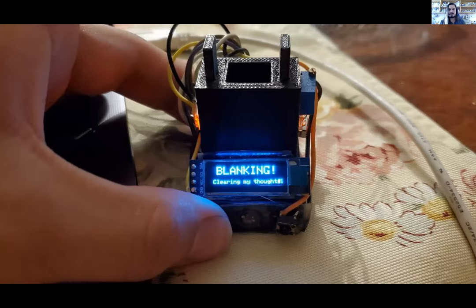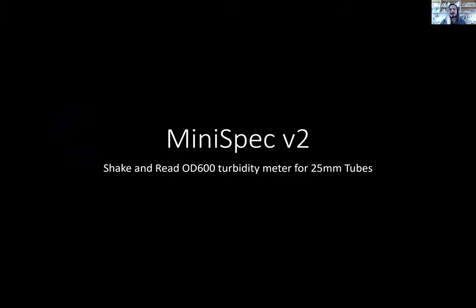And it just works, and it's really, really fun. So, going along that logic, I said, okay, this is for a single shot. What about the ability to measure cultures as they grow, right? Which is kind of a holy grail for molecular biology, is trying to find a way to accurately measure the optical density in a flask super quickly, ideally inside the flask.